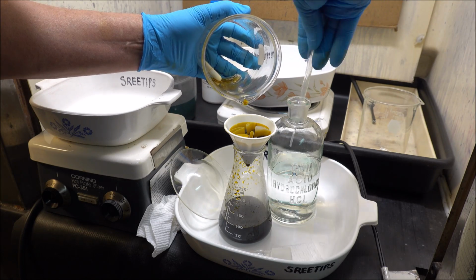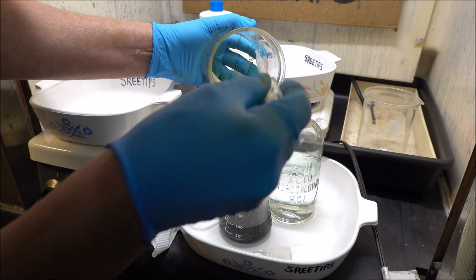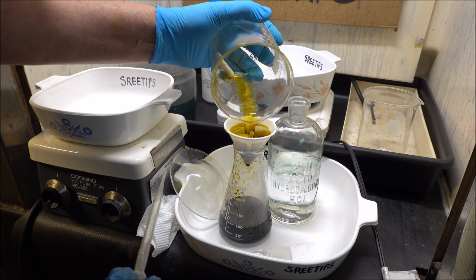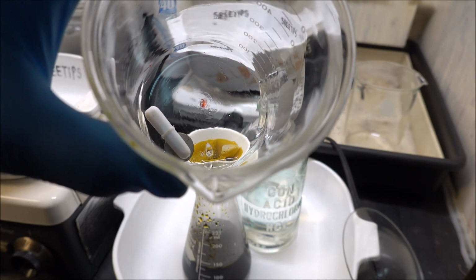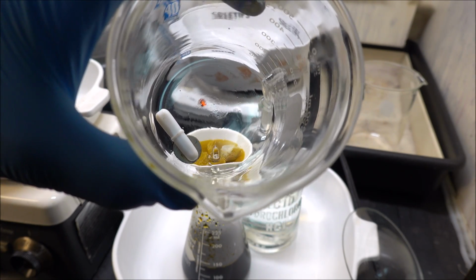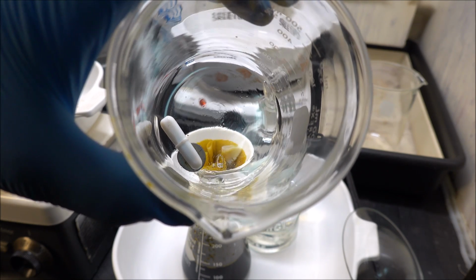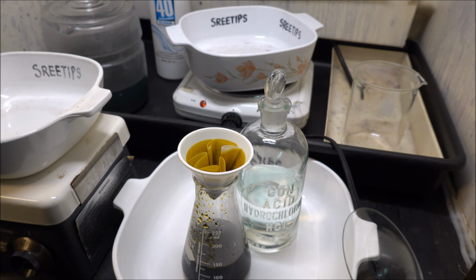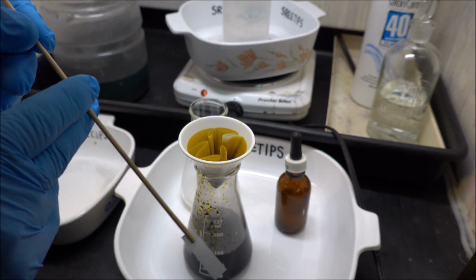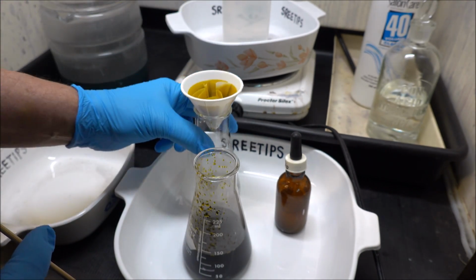Now I'll rinse everything out of here with some hydrochloric acid. And all that's left in the beaker there is a few shards of glass. It's all rinsed out. I've got everything going through the filter now. We're looking good. Filtering is complete. I'll save the filter here and put it in my paper storage.